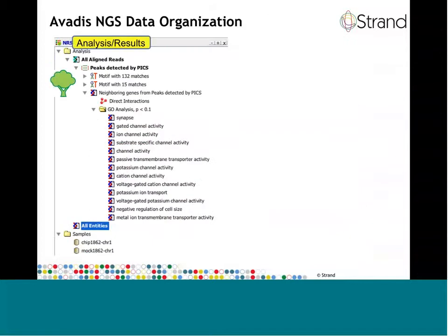So now we have completed a ChIP-Seq workflow. It's time to discuss another great feature of Avadis NGS, which is the hierarchical nature of the result storage. In Avadis NGS, the results of any filtering or analysis is stored permanently with the experiment and stored in an hierarchical and chronological order. This makes it very easy to see how you arrived at the results in your experiment when you return to your experiment in a few months from now, when you can't really exactly remember what you did and how you got those results.